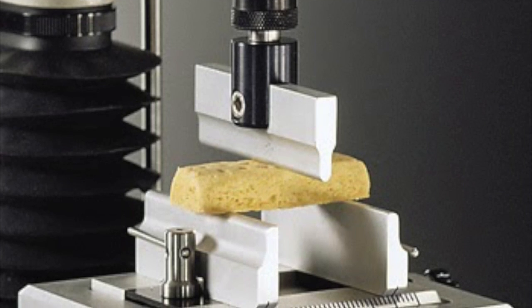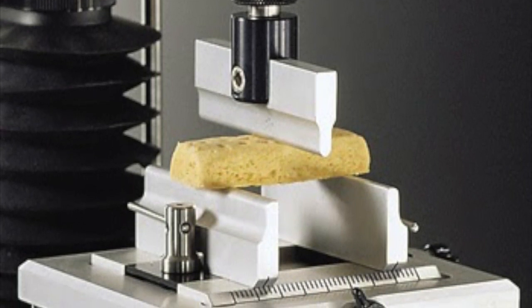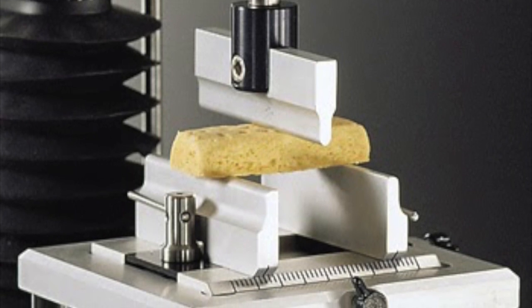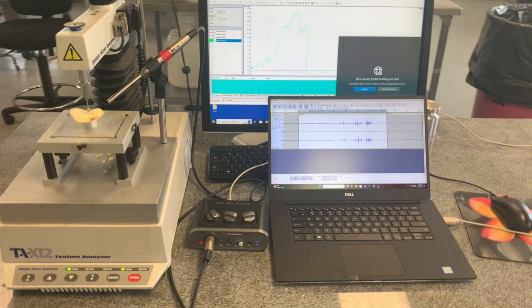Crispness in foods is a sensory attribute that can be measured using various methods. A few commonly used techniques include instrumental crispness measurement, sensory evaluation, and acoustic analysis.